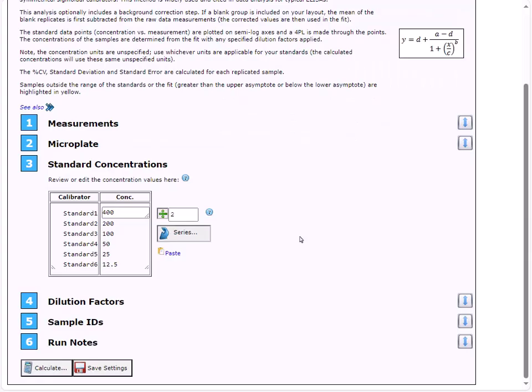Next, we can update the standard concentrations. The default concentrations starting with 400 and following a series divided by 2 is correct for my assay, so I don't need to make any changes here.